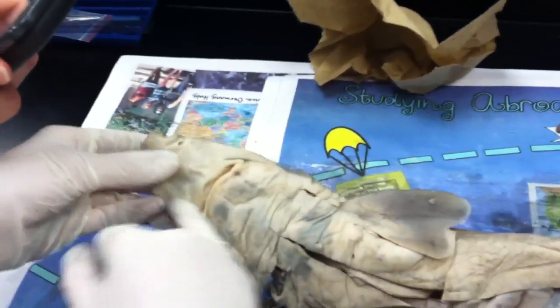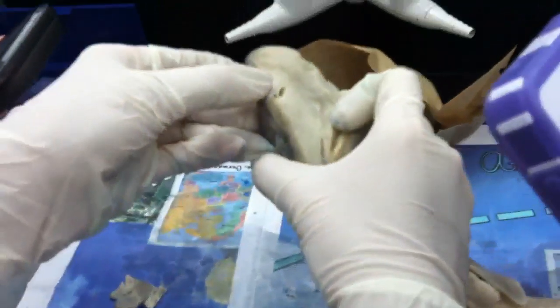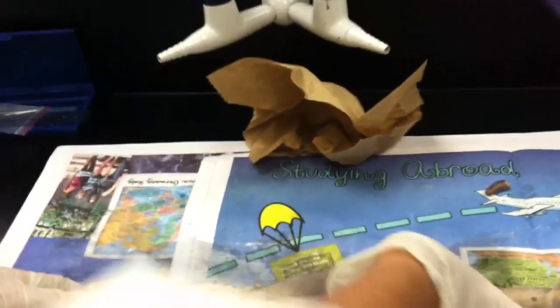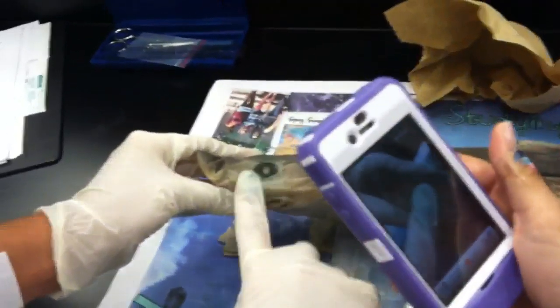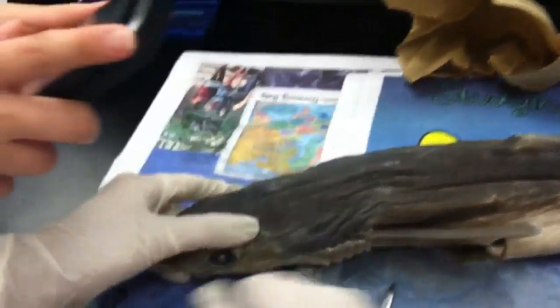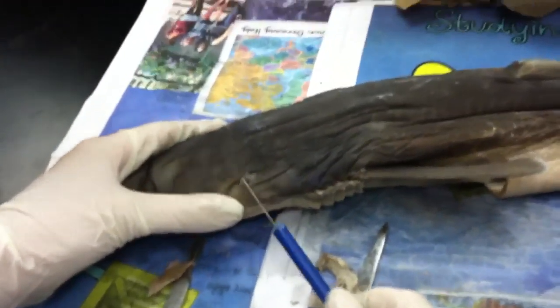Eyes — these two. There are nostrils: one that's horizontal and one that's circular. These are the eyes, obviously. Spiracles are these little holes. What do the spiracles do? We'll read on it later.